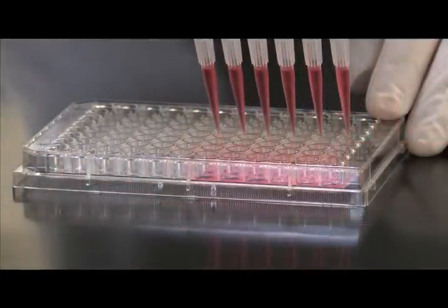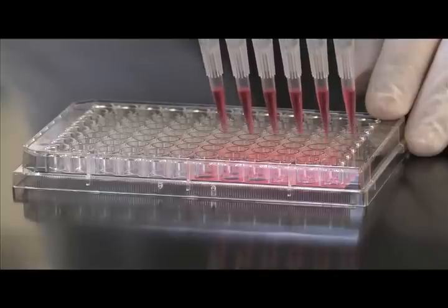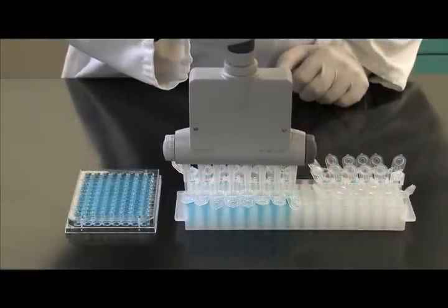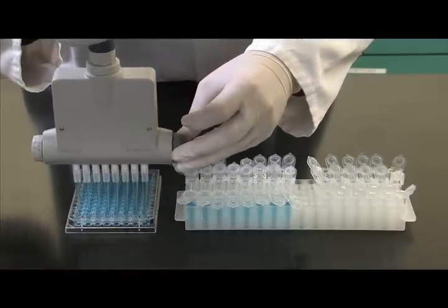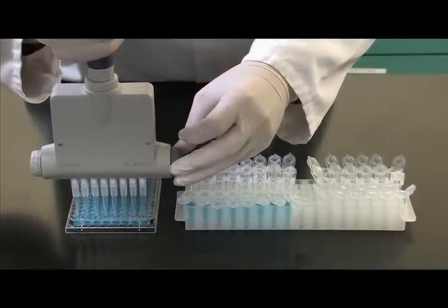The adjustable spacer is also available as an electronic pipette. Precision, accuracy and ergonomic design. Reynon's family of adjustable spacers will simplify and streamline your application workflow.